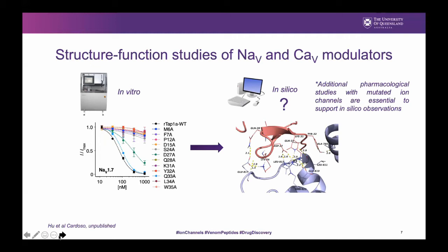While we are satisfied with our in vitro data collected via automated electrophysiology in QPatch, which investigates residues in the sequence of a peptide inhibitor, the understanding of how the peptide interacts with the channel, usually performed via in silico molecular docking studies, still remains incomplete due to the lack of information of mutations in this channel binding sequences performed in vitro. So additional pharmacological studies with mutated ion channels are essential to support in silico observations.